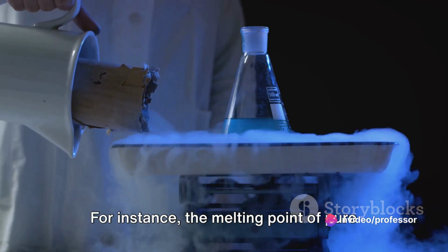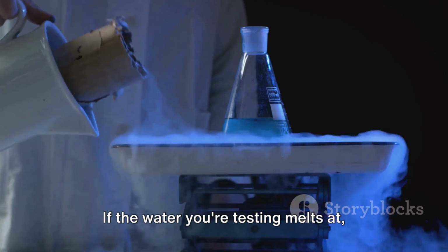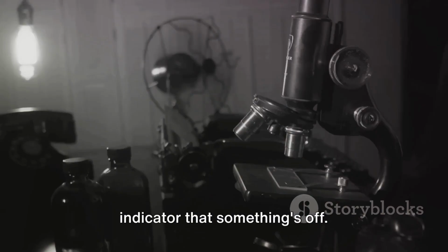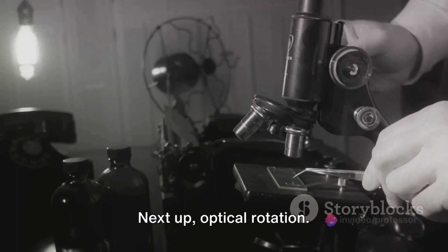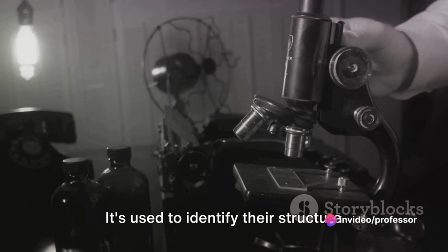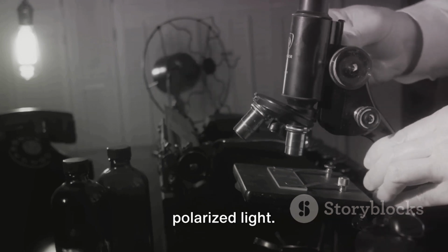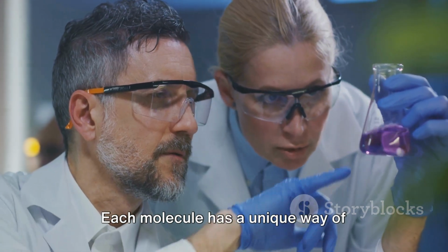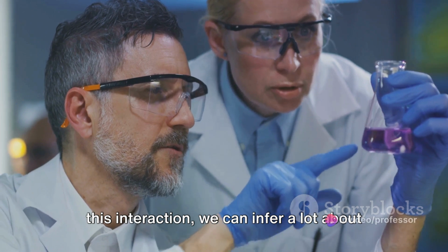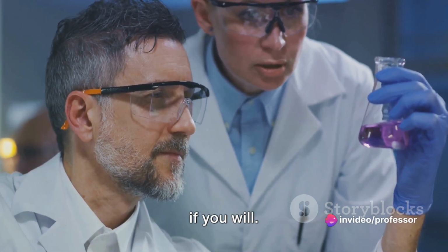For instance, the melting point of pure water is 0 degrees Celsius. If the water you're testing melts at, say, -1 degree, it's a clear indicator that something's off. Next up, optical rotation. This technique is like a secret handshake for molecules. It's used to identify their structure based on how they rotate the plane of polarized light. Each molecule has a unique way of interacting with light, and by studying this interaction, we can infer a lot about the molecule's structure. It's a bit like molecular fingerprinting, if you will.